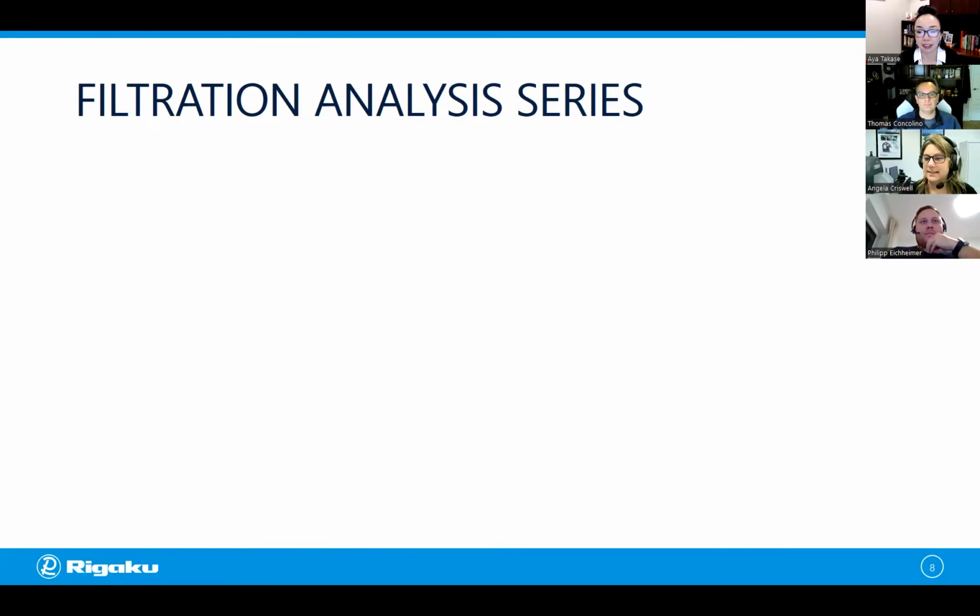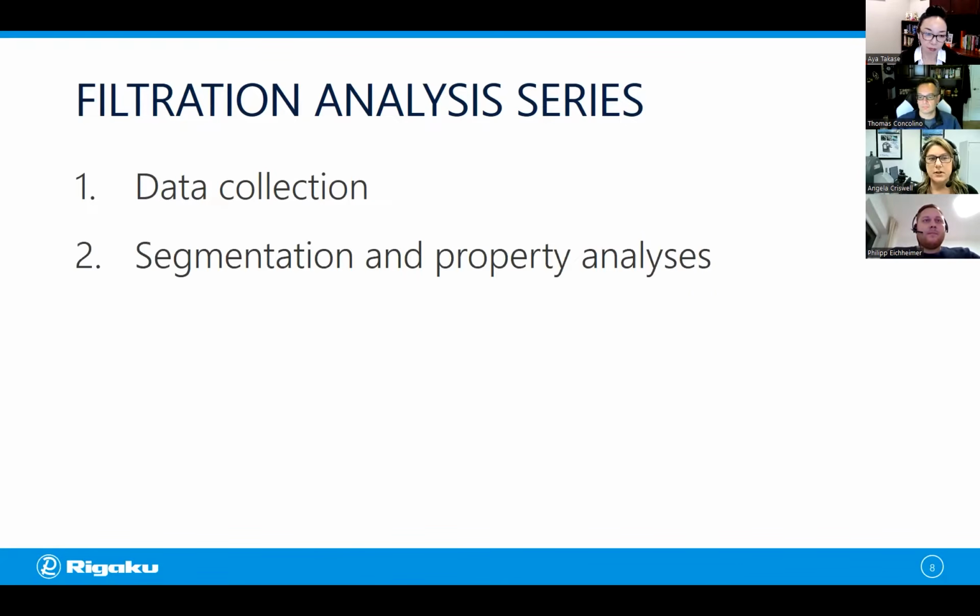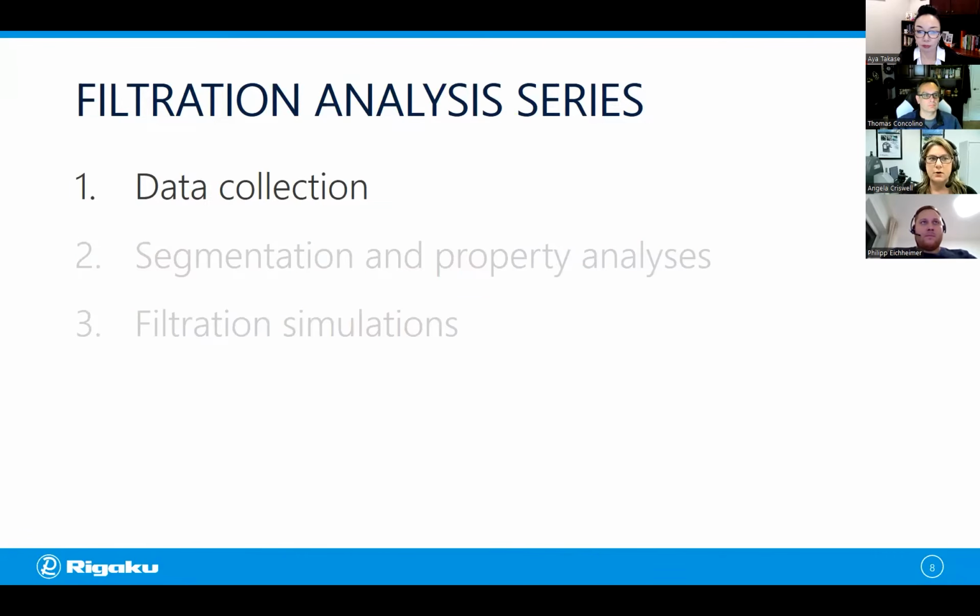Well, great. Thanks, Aya. Hopefully there's something in here for each of you. Just to let you know what we're going to cover in this series, we're going to cover CT data collection. We're also going to cover segmentation and property analyses in our filtration analysis. And then we'll wrap up in the 3rd session doing some filtration simulations. But today we're focusing on CT data collection.